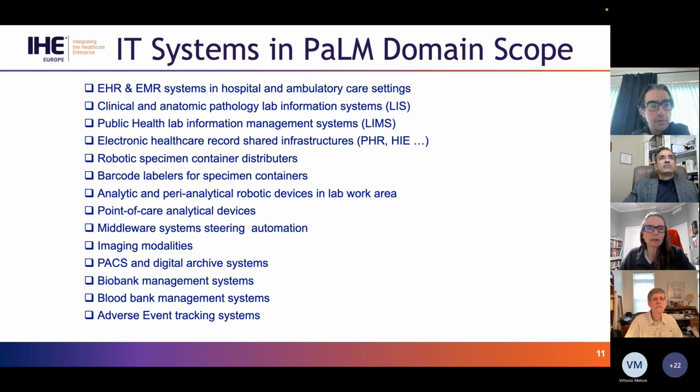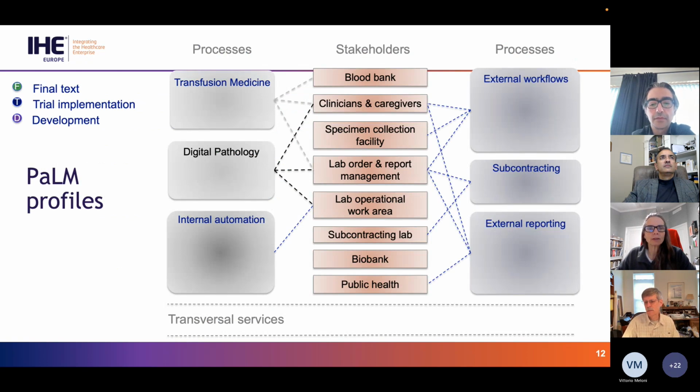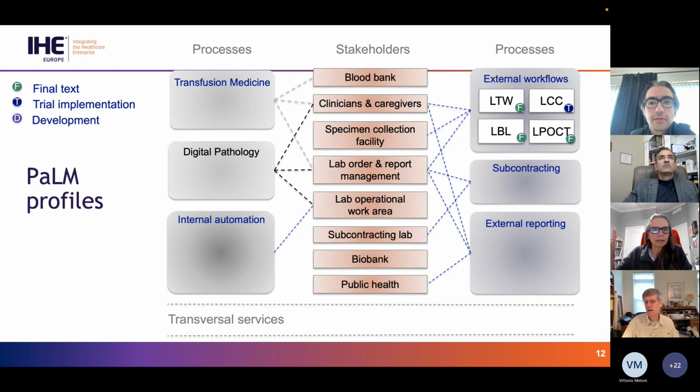So these are some of the IHE systems that play in the PaLM domain space. And so if you see one of your systems on here, then you can play too. So next slide. These are the different profiles we support. I think you need to do some clicks here.